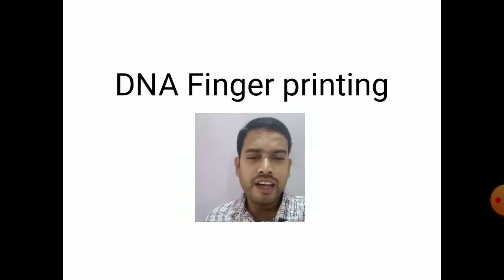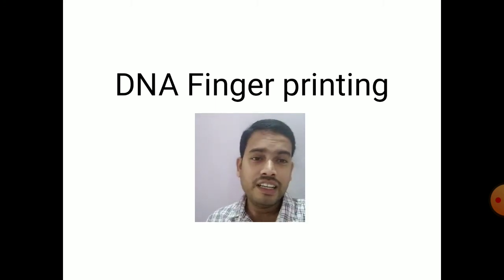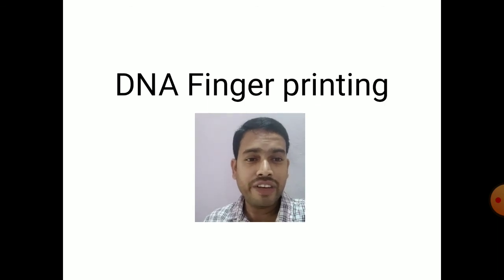issues, and also taxonomical studies were difficult. After the invention of DNA fingerprinting, all these techniques, construction of dendrograms, evolutionary techniques became easy, and also the migration of species and identification of species became easy with the help of this DNA fingerprinting technique.